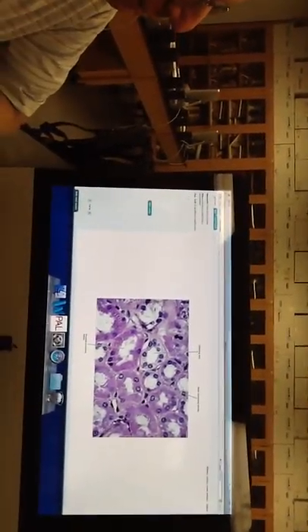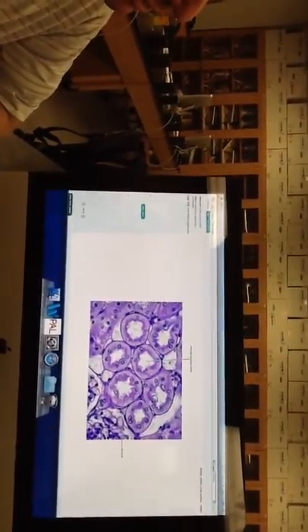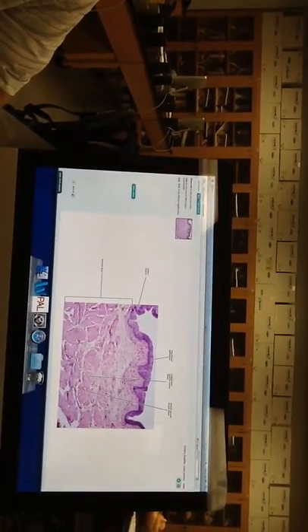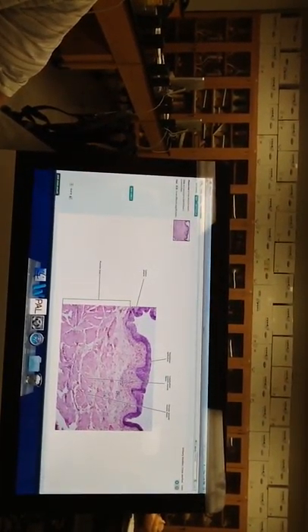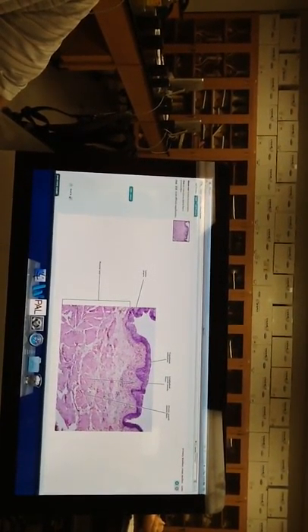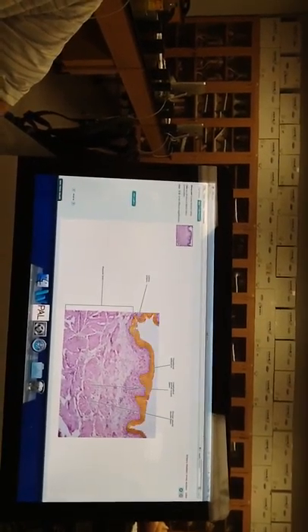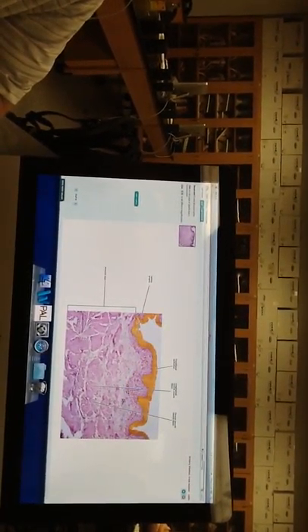There's another... Well, you folks tell me what's that. Remember the word? A glomerulus. Glomerulus, right? Or Bowman's capsule. Up close. That's cutting across some of the... There's not that much else to it.